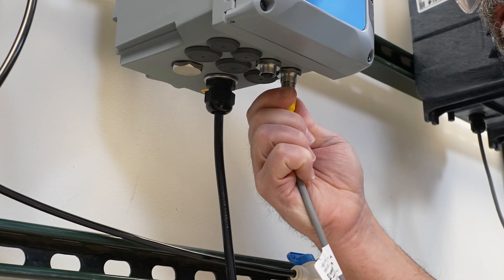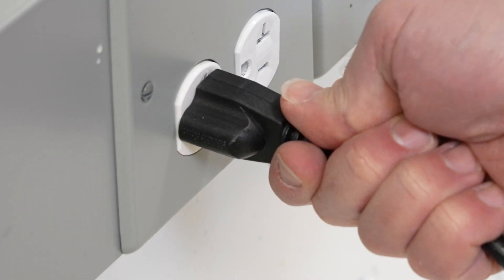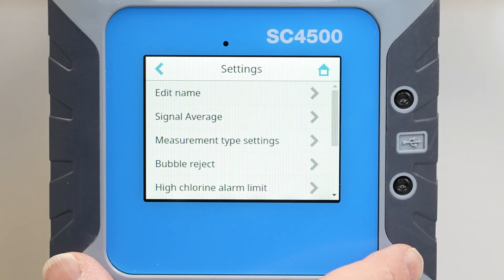Connect the analyzer to the controller. Connect the controller to power. Confirm you have the latest software for the controller and analyzer.